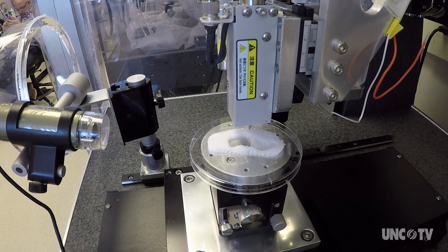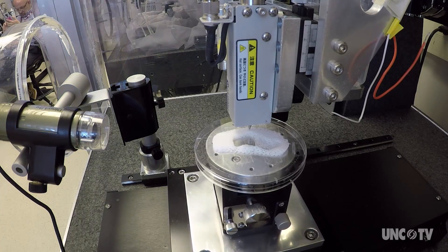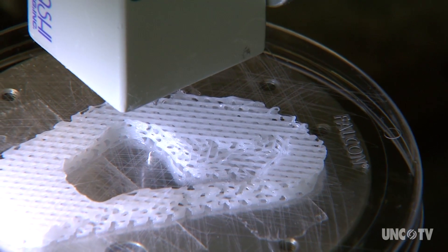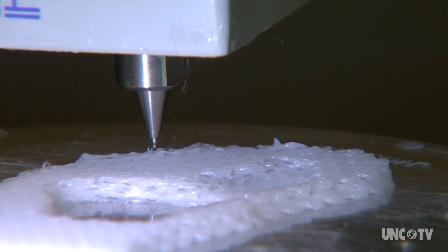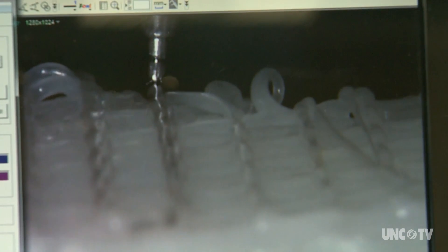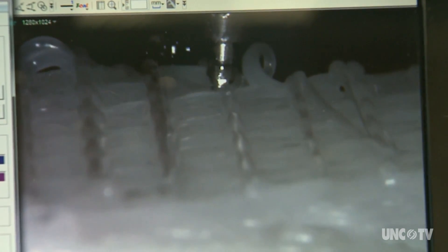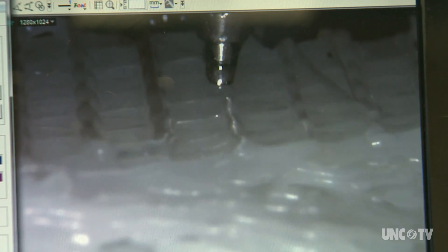This is the integrated tissue and organ printing system. What it prints is alive. There are tens of millions of living cells suspended in a gel. There's also a precise lattice work of microchannels, 200 microns wide, imprinted into the system. The vessels allow blood and nutrients to flow through the tissue.